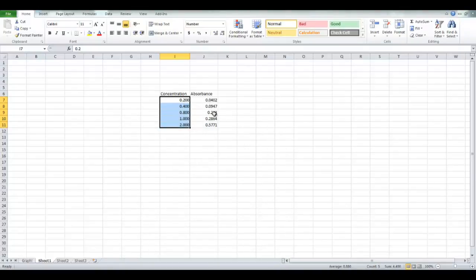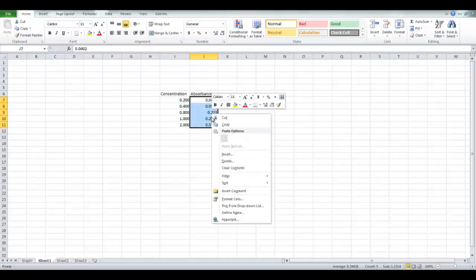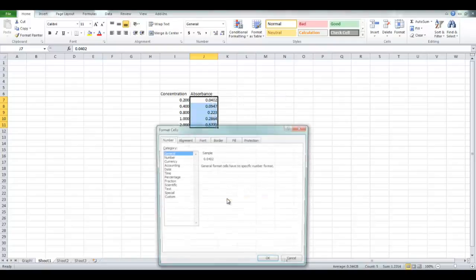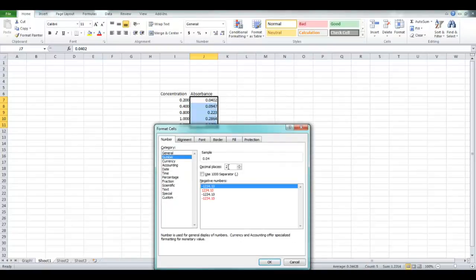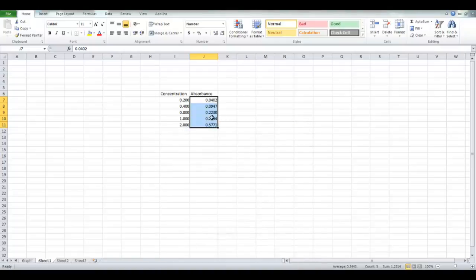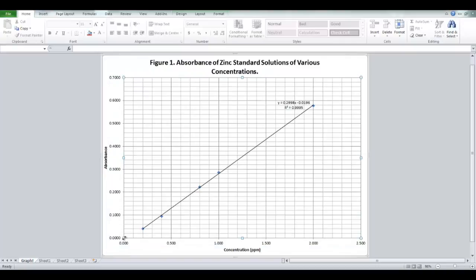And again, so select your data. Right click, go format cells. Go to number, and up your decimal places. As you can see, it added in that zero there. So, proper sig figs. And of course, everything you do on that sheet will automatically follow over to your graph. As you can see, the axes have proper sig figs.